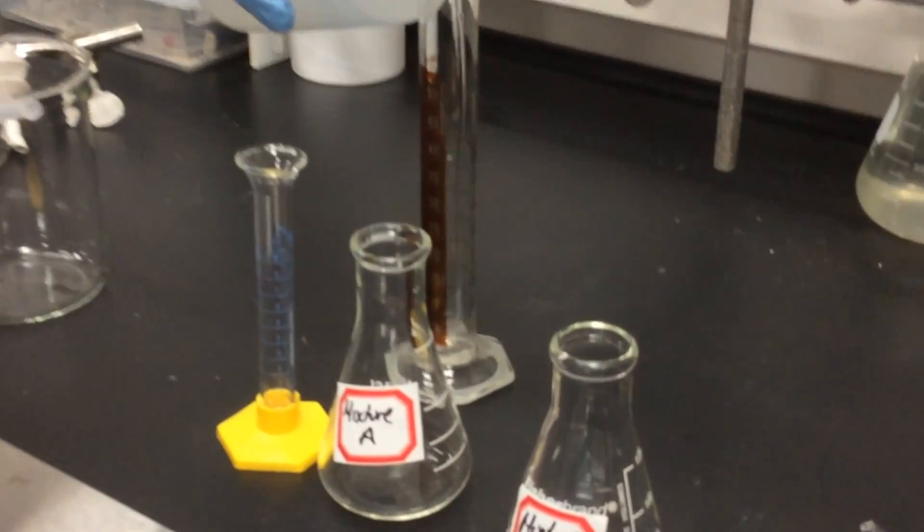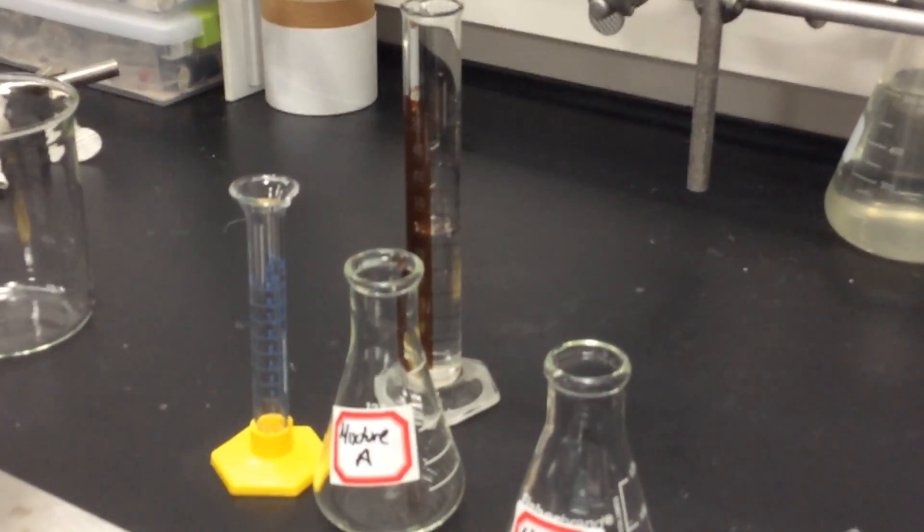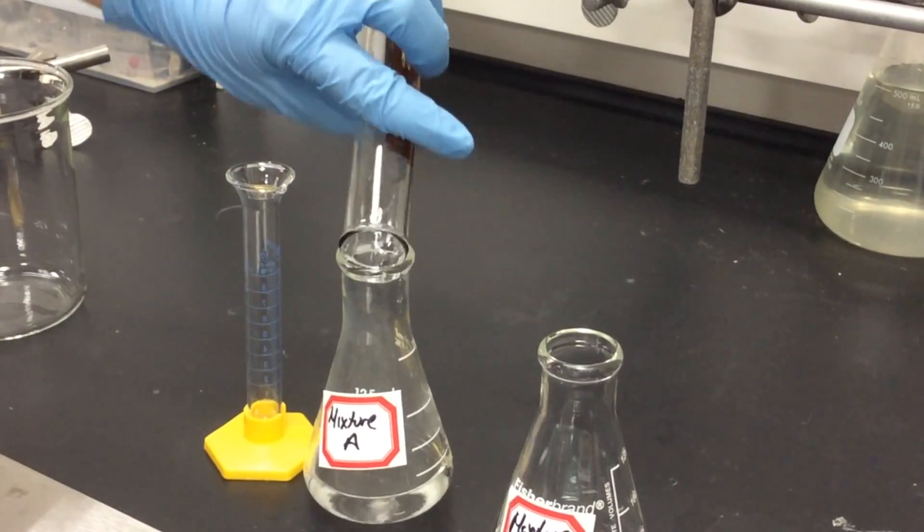Next, you're going to add 30 milliliters of water into your graduated cylinder, and then take that 30 milliliters of water and pour it into mixture A.